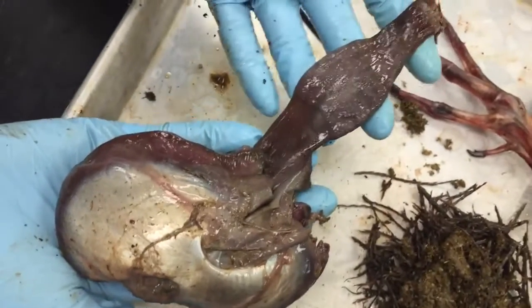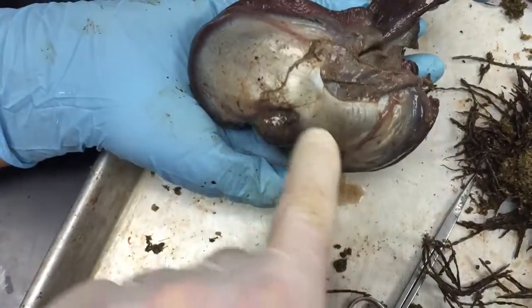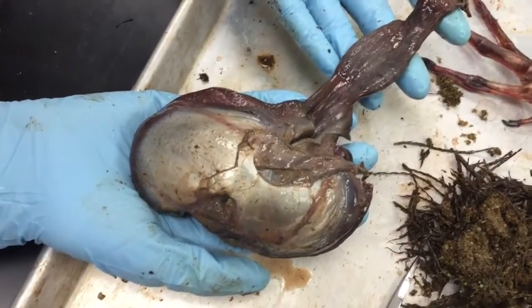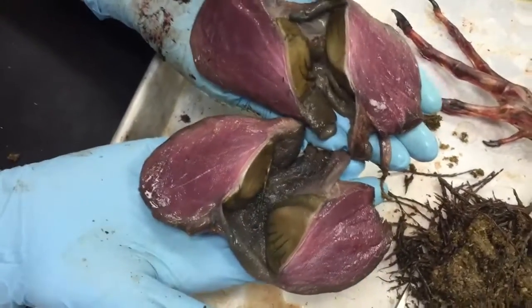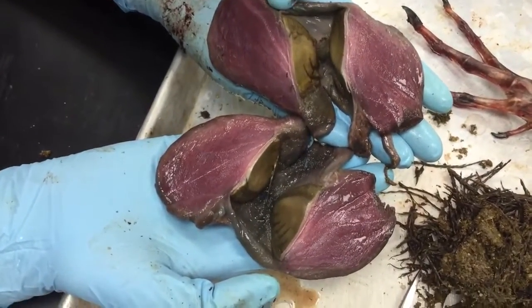She pulled out a ton of grass and other plant material from there. This thing is all muscle — there's actually muscles forming a bridge, and then there are muscles that pass underneath that bridge. Go ahead and open that up. You can just see all the muscle that's forming this thing.